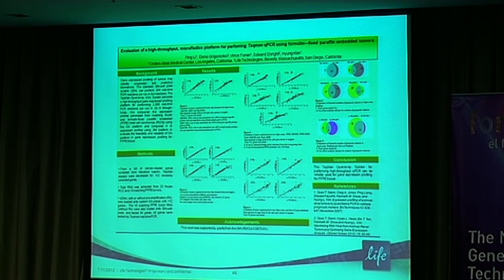They provided us samples, and there were 2 very important things they wanted to answer. One, do we trust the person at Life Technologies that said preamp will not introduce bias? So they tested that. And they also wanted to know, more importantly, can we compare FFPE, so formalin-fixed, paraffin-embedded samples, back to their matched frozen, pristine samples and still arrive at the same signature? Do we get the same correlation?